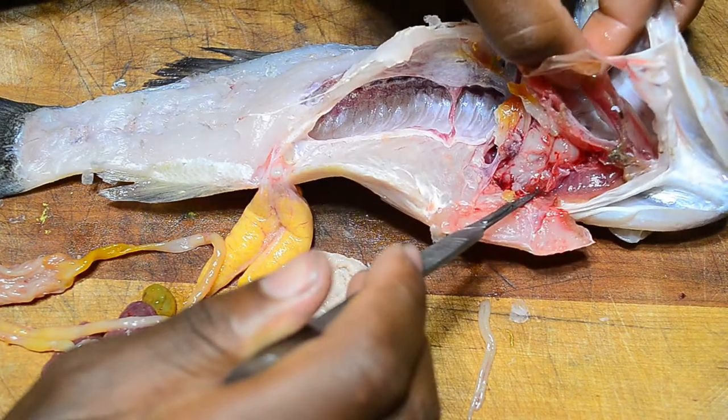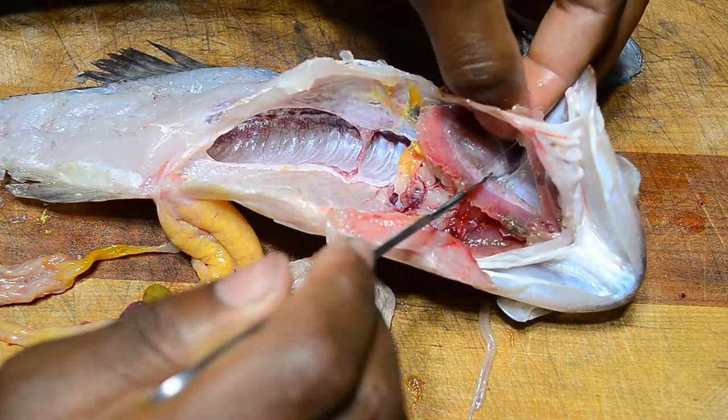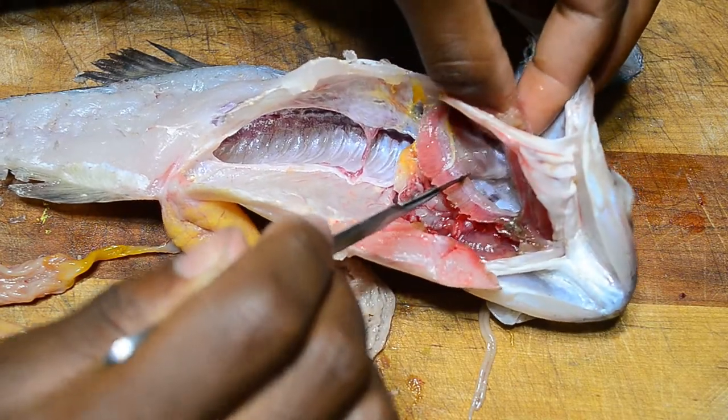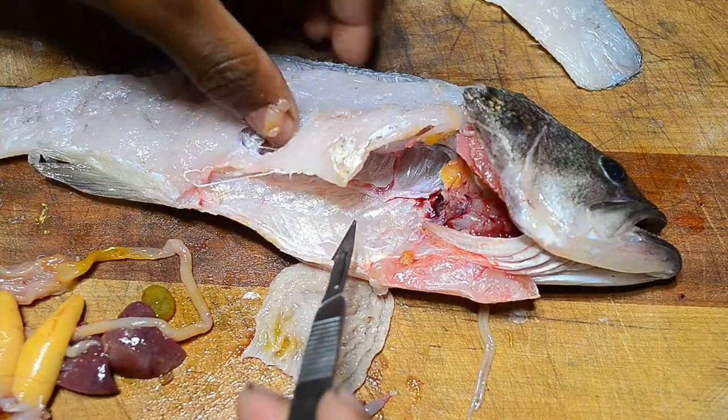Here you can see all the gills, and there are more parasites visible as well.